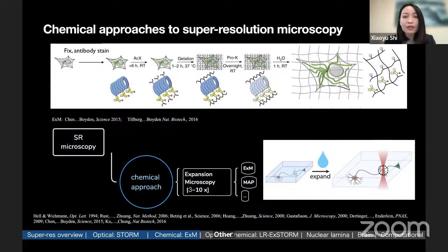And then you form the gel in situ, meaning that you embed your sample into the liquid monomer to form the polymer, and the monomer can penetrate the cells and get into every corner inside of the cells and inside of tissues, and also outside of the samples, and form a hydrogel inside out. So that's the so-called in situ hydrogel.